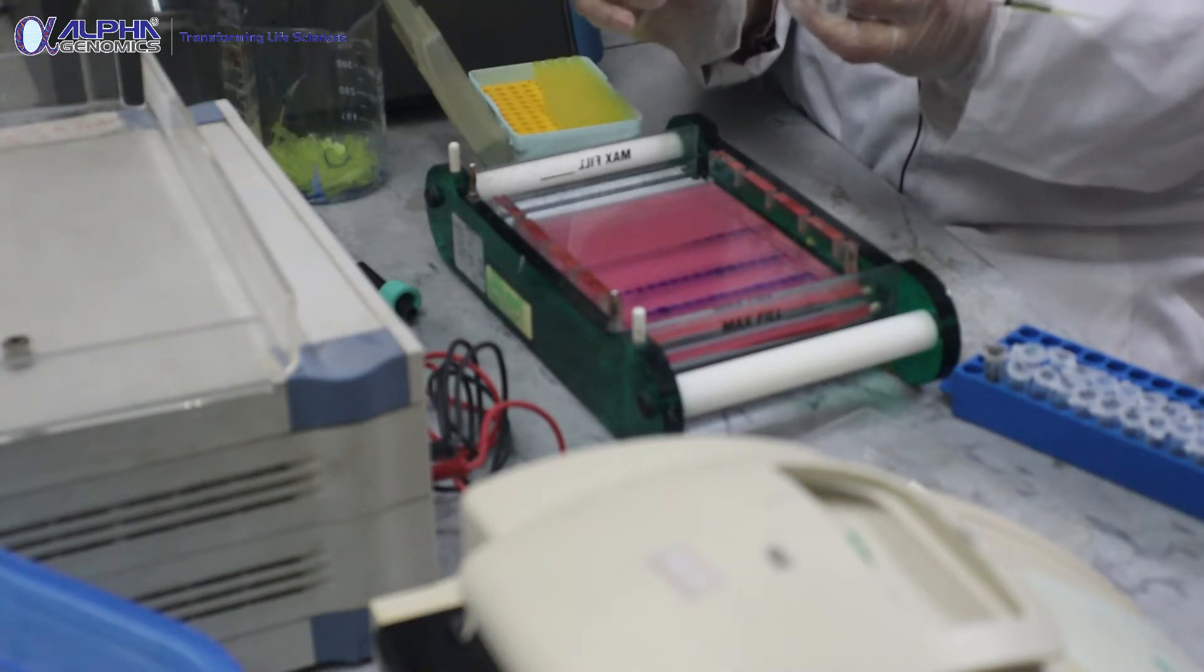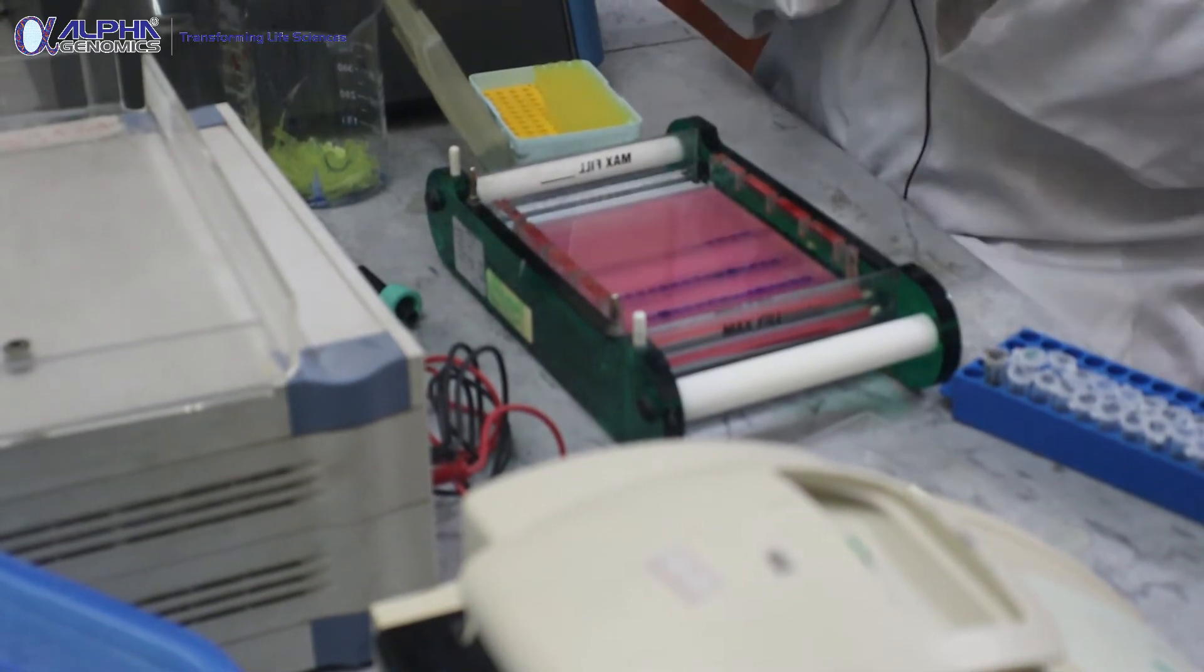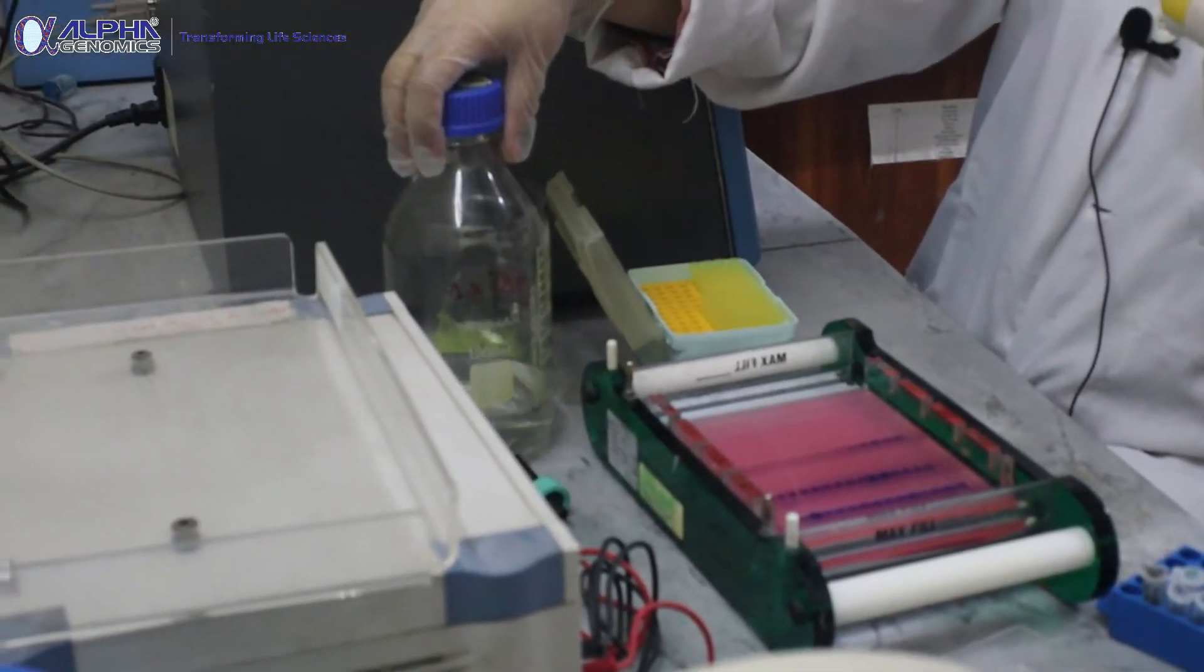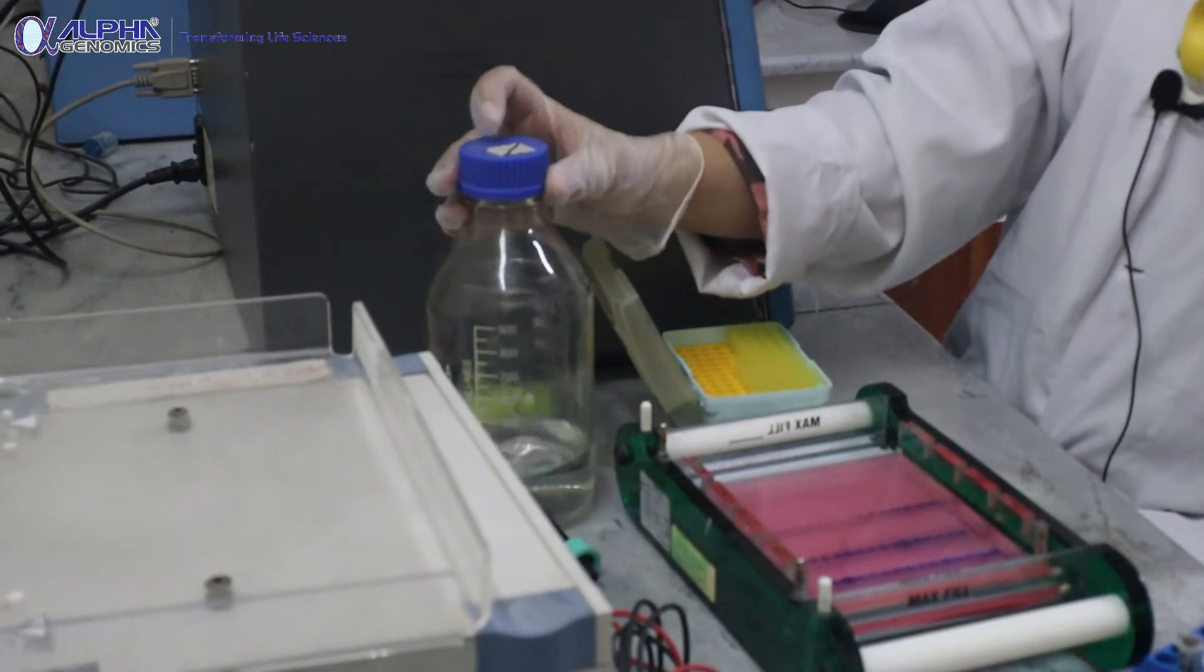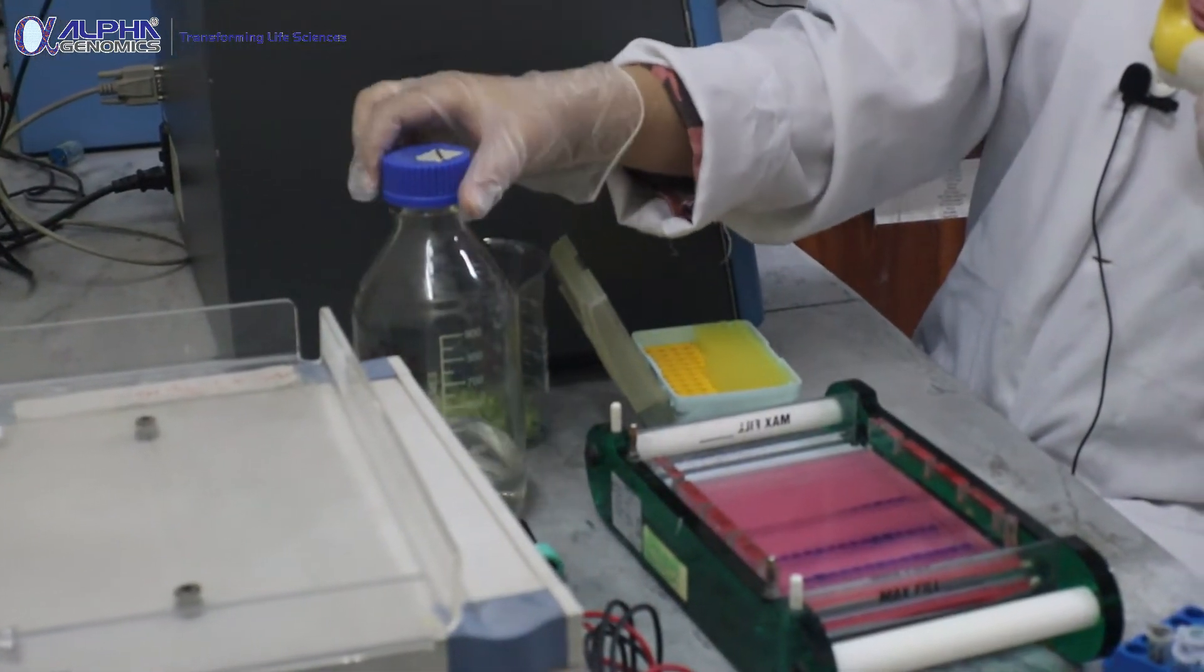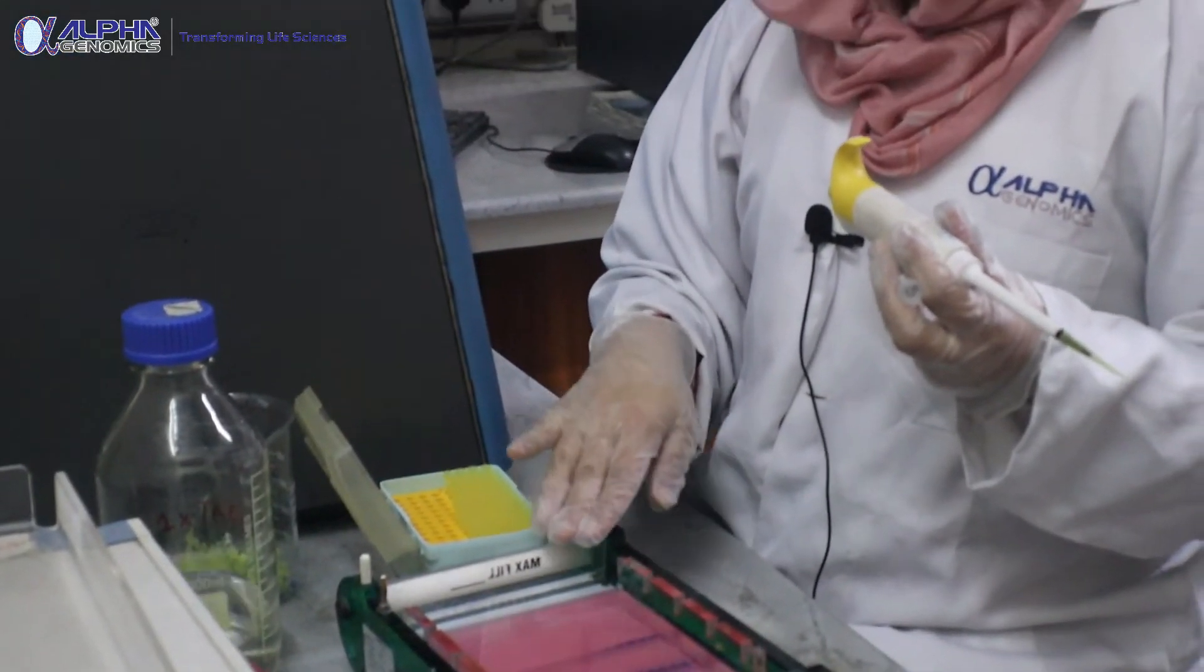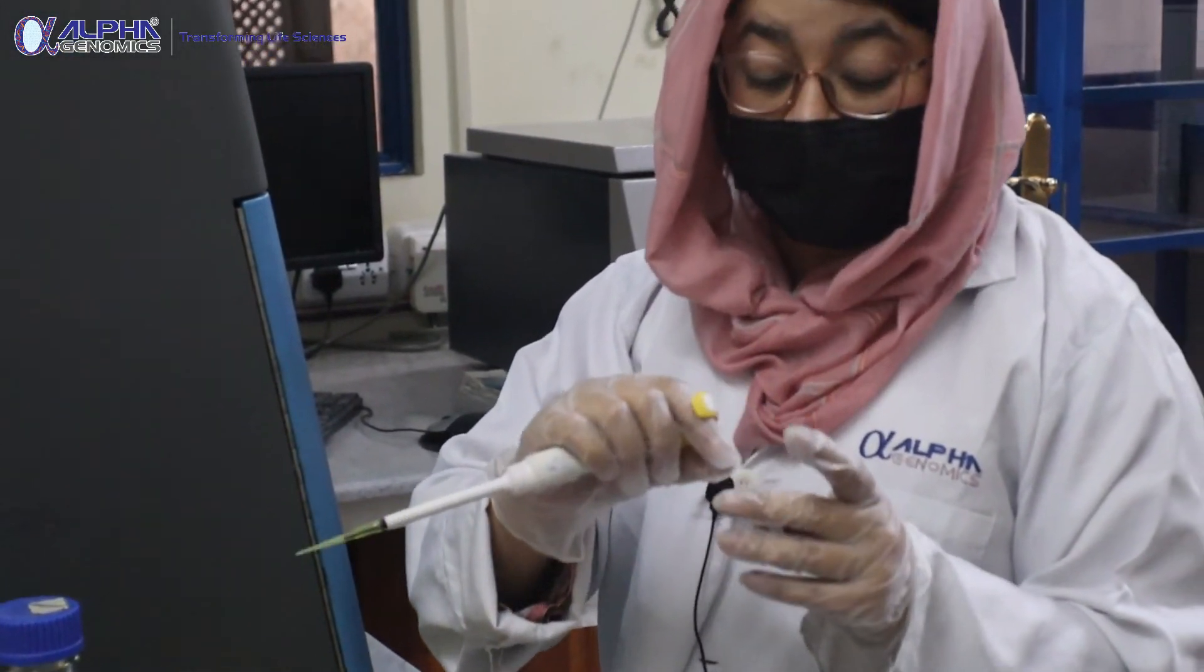For you to use them in the working solution you have to dilute them. Right now over here you can see I am using 1x TAE. I have already prepared it and the bottle was autoclaved. The running buffer and the buffer in which I have prepared the gel is 1x TAE.